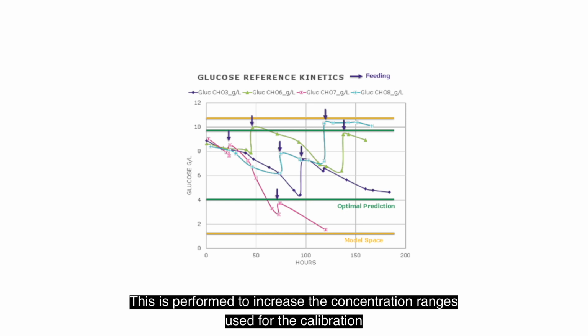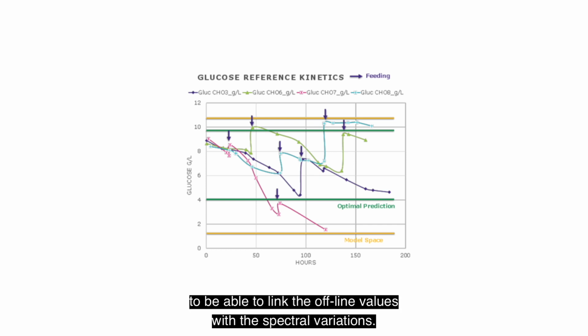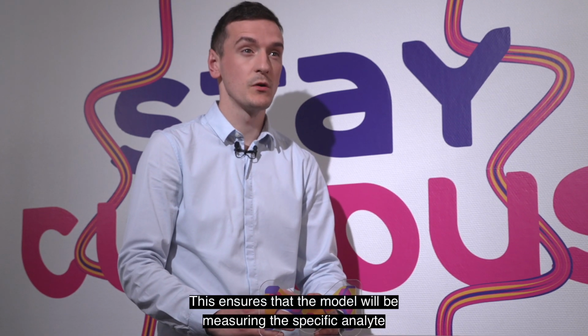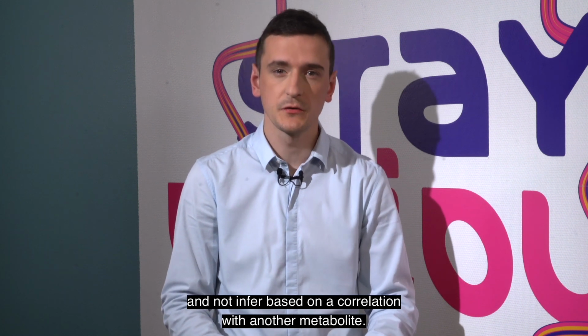This is performed to increase the concentration ranges used for the calibration and to have significant changes in the spectra to be able to link the offline values with the spectral variation. This ensures that the model will be measuring the specific analyte and not infer based on a correlation with another metabolite.